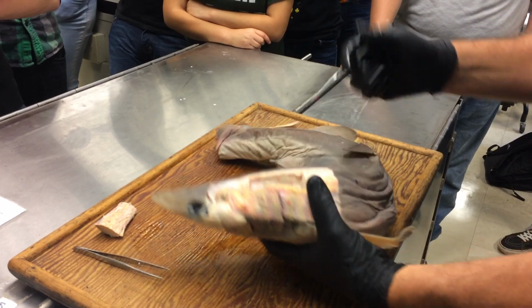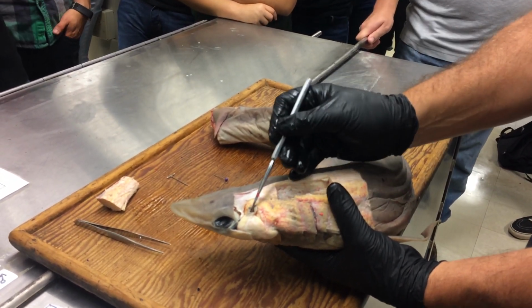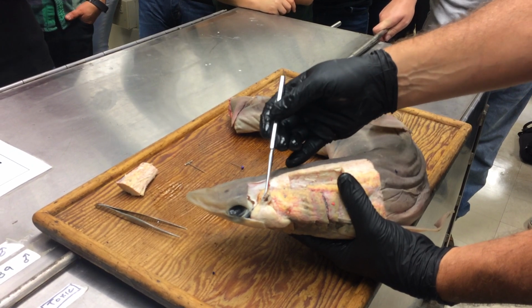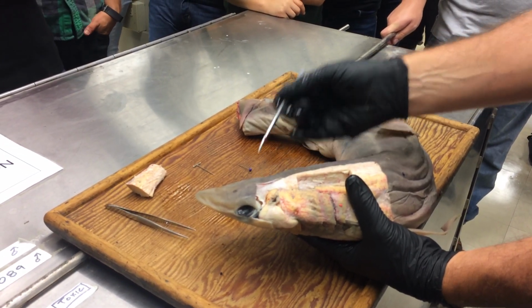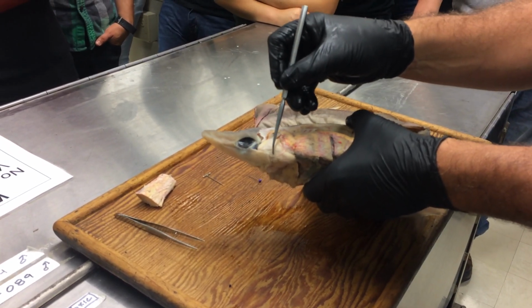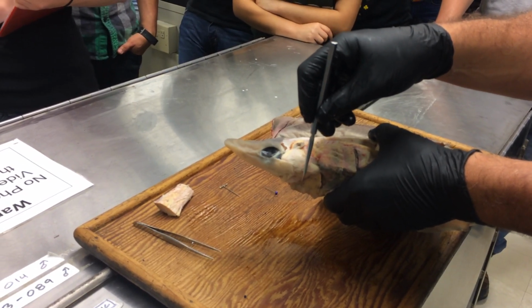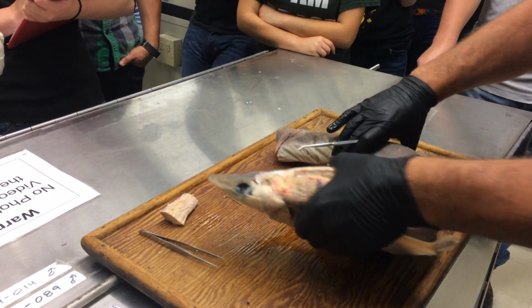And you guys can start, and I'll bring it around because I know you can't see it all over there. But remember, the spiracle lies in between the mandibular arch in front and the hyoid arch behind. So the mandibular arch muscles are going to be in front of the spiracle. And there's a big one right on the jaw joint here that's running from the palatal quadrate down to the mandibular cartilage, or Meckel's cartilage. And that's the jaw closing muscle, this big one.